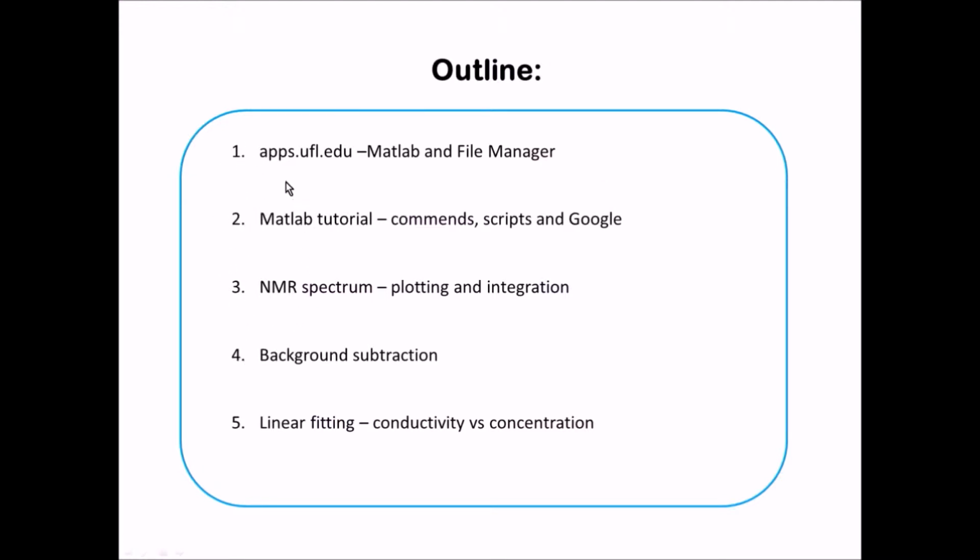In this video, we will cover the following 5 topics. After the lab section, a lot of students gave me feedback saying that it's really difficult to use Matlab and the file manager in this online system. So we first talk about how to use it. Later on, I will give you a quick Matlab tutorial on how to use it to plot and integrate the NMR spectrum. And later on, I will discuss background subtraction. And finally, we will talk about the linear fitting of the data.